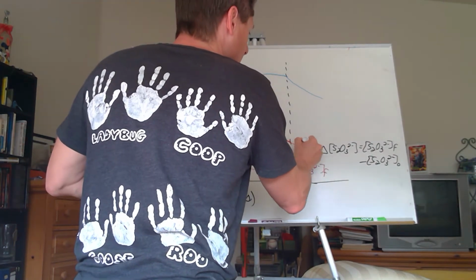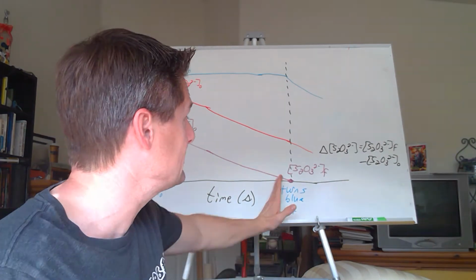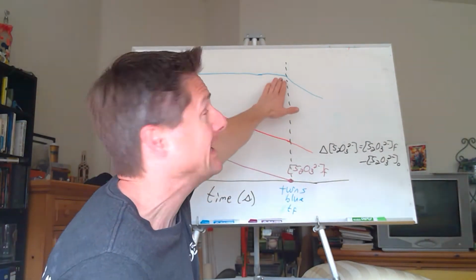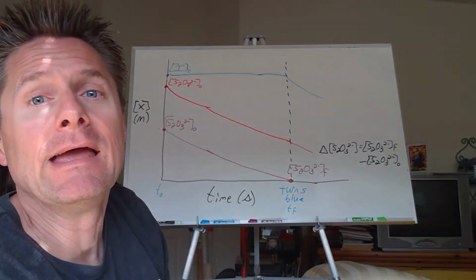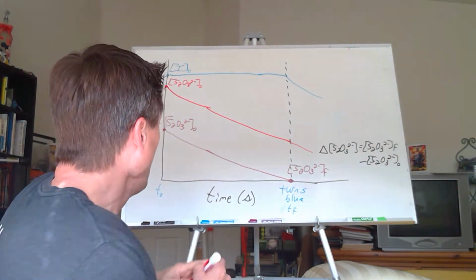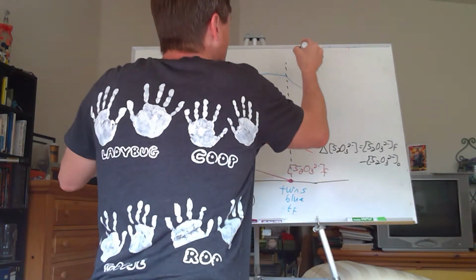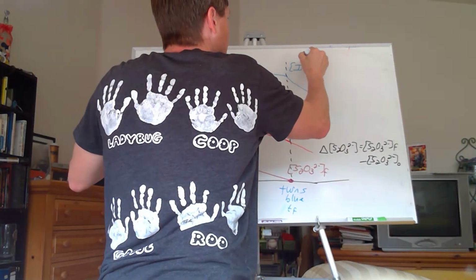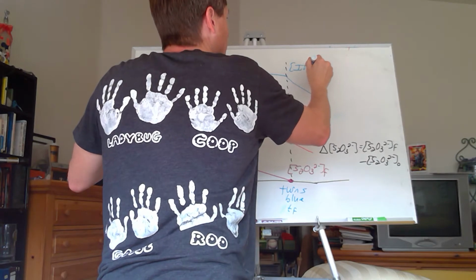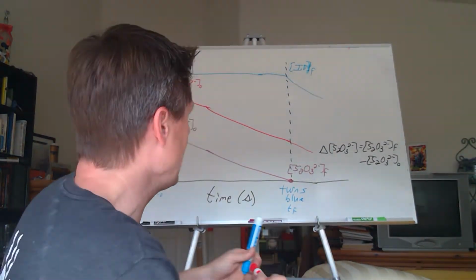So notice the reaction of interest is still going after it turns blue. So we're stopping it here because we can't have the I- dropping. It has to stay constant. So we have to end it right there. Right? We can also look at this as the final I-, right? So this will be I- final, which should be the same as the initial, right?